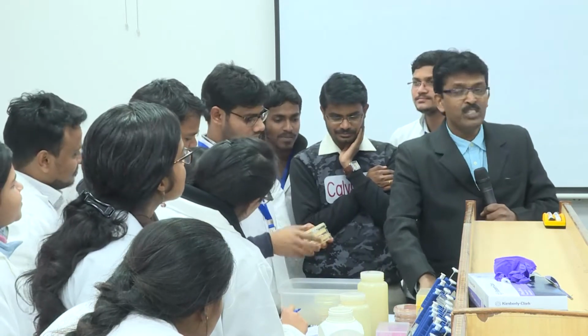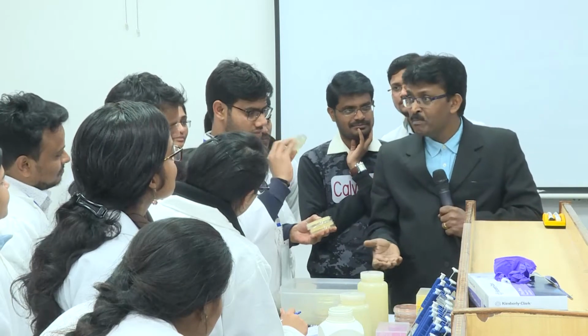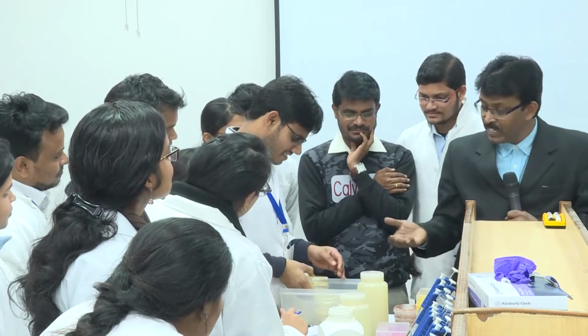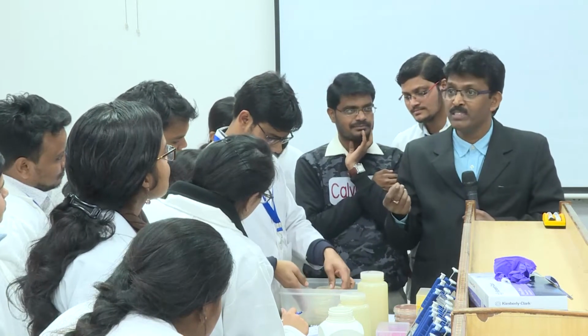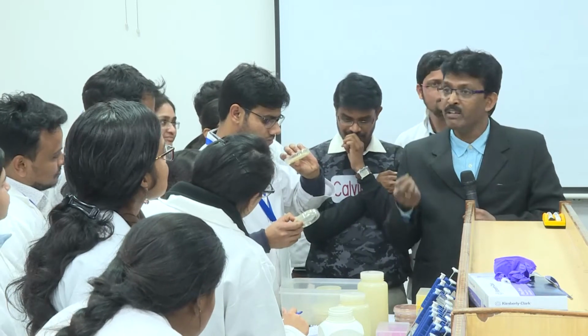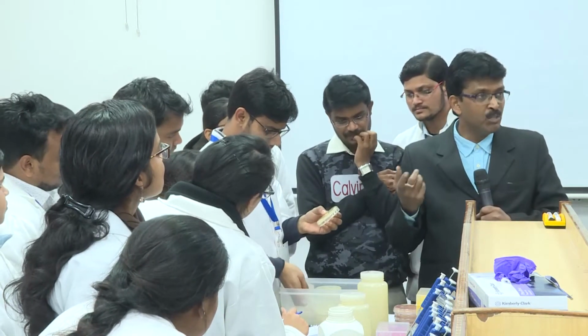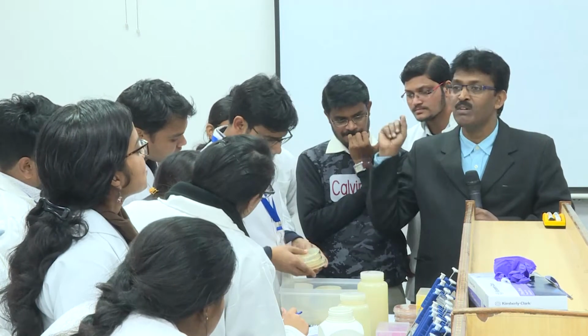Yeah, unfortunately the training is getting over on Monday, so if any one of you want to follow it up, you are most welcome. If you feel any one of the colonies is suspected to be a Pseudomonas and you suspect them to be a transformed one, please come back to us. We will give you the primers, the forward and reverse primer. You can use it, and if the insert is there, then that is the transformed colony.